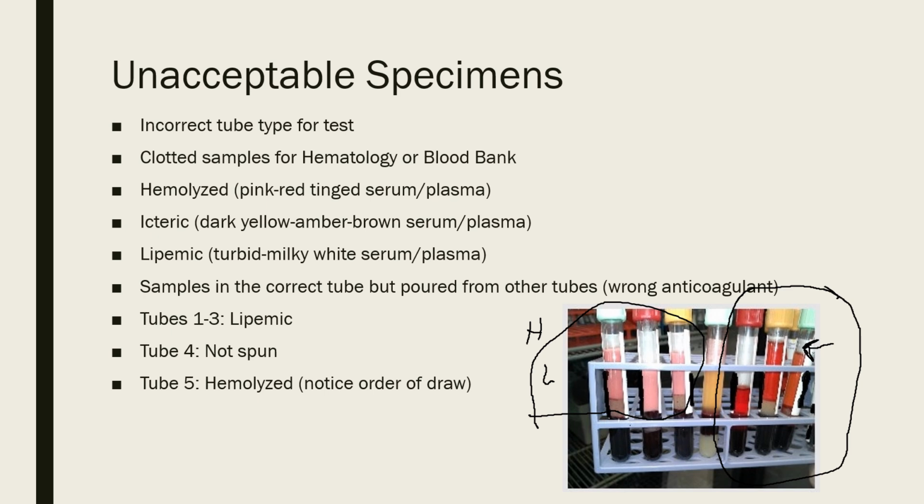So they had eggs and bacon and sausage, and those chylomicrons will show up inside of that plasma because the body's not processed it yet and broken down that fat and used it. So you could potentially see something like this. Now there are patients whose cholesterol is just extremely high. They've got a lot of those triglycerides and things in their specimen, so you could see something like this.